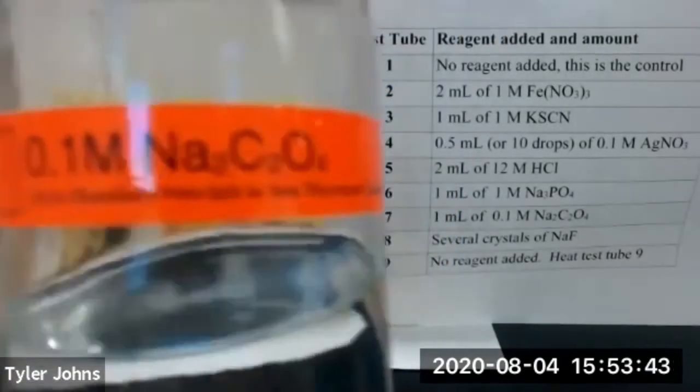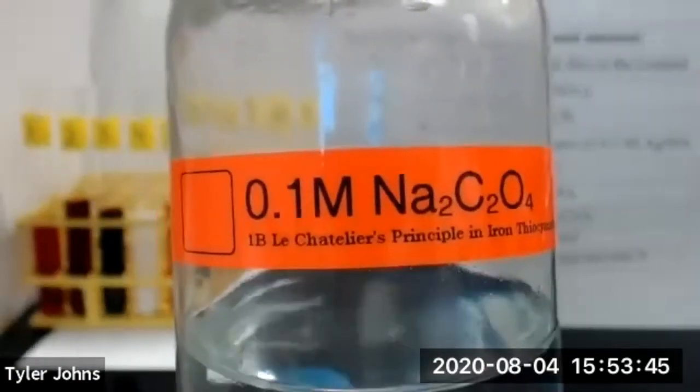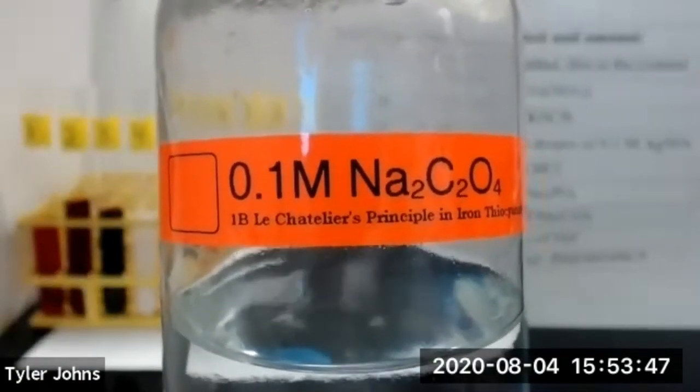We'll next add one milliliter of 0.1 molar sodium oxalate to test tube number seven.